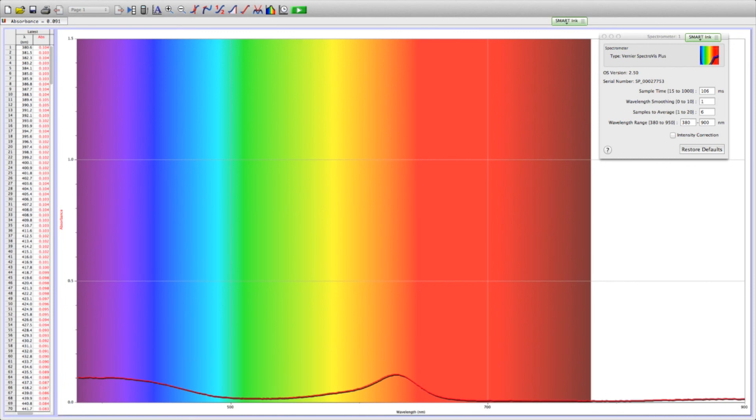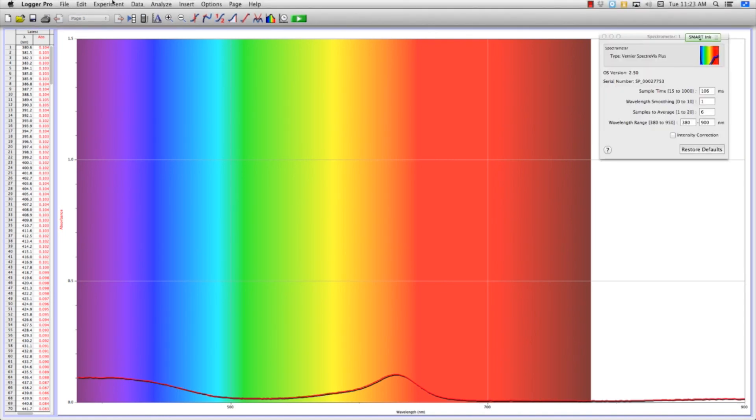In order to analyze a single point on the curve, go up to the toolbar and click Analyze. Then click Examine.